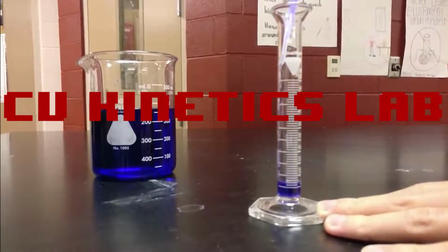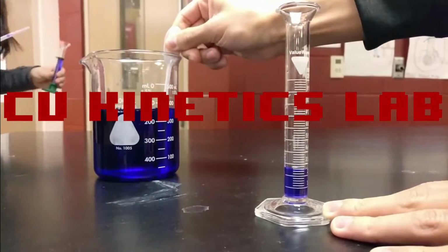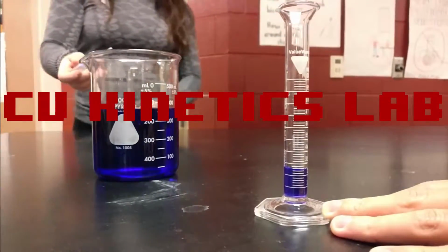This lab is about measuring the absorbance of a reaction between crystal violet and sodium hydroxide, and from here determining the rate law of the fading of the crystal violet. Before performing this lab, be sure to be wearing safety goggles.